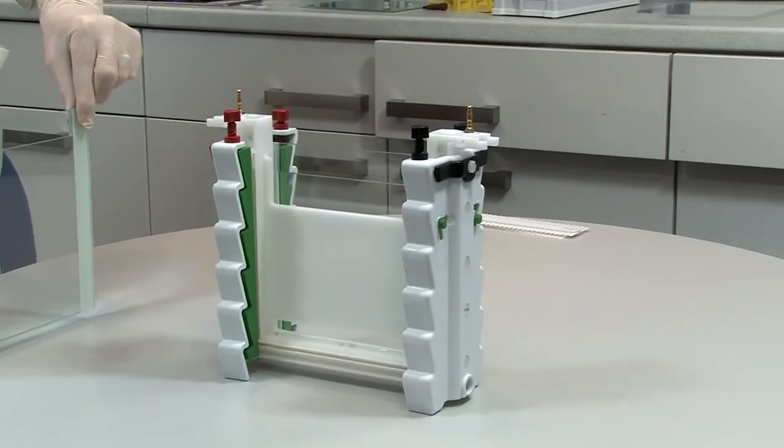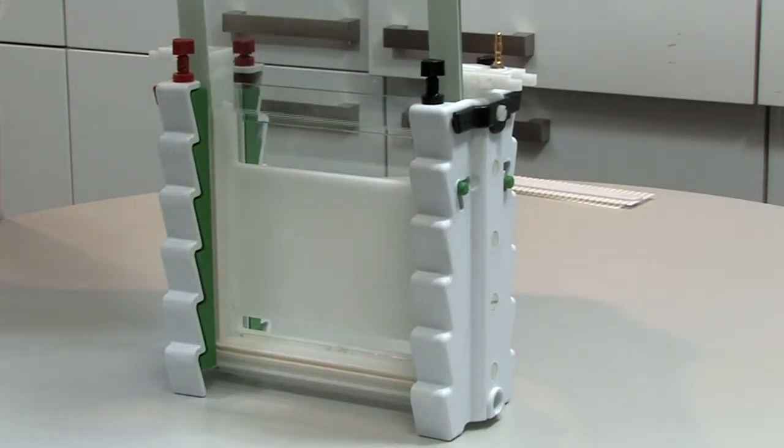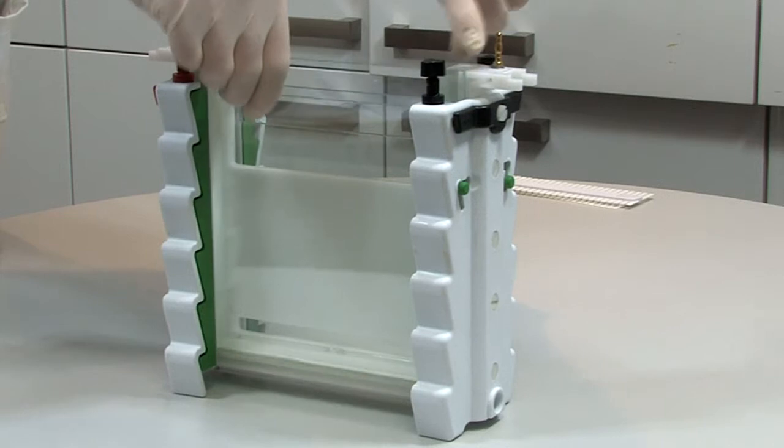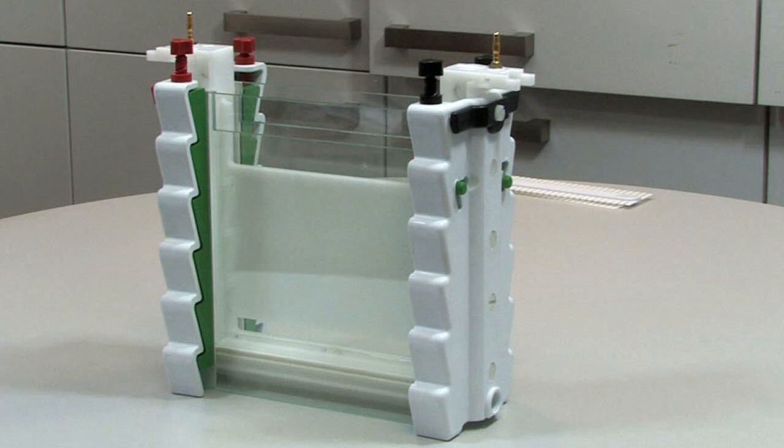With the green clamps now out of the way, carefully slide the glass plate sandwich into the upstand, lowering the glass plates until they are flush with the bottom of the side cheeks on the lab bench surface, not on the casting base.